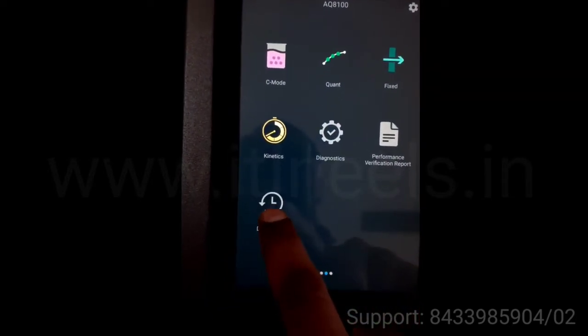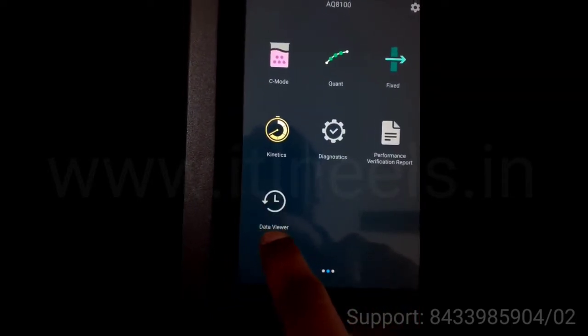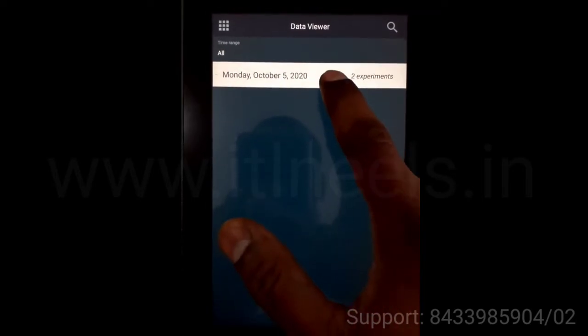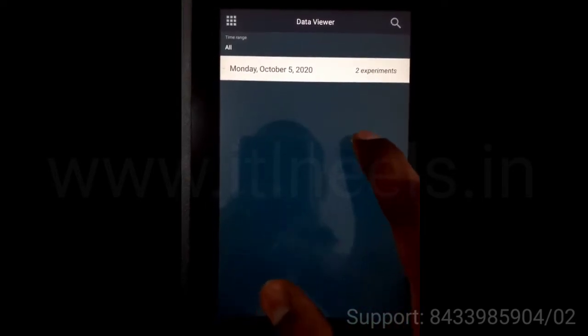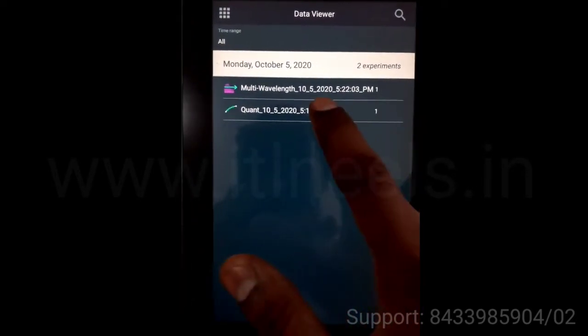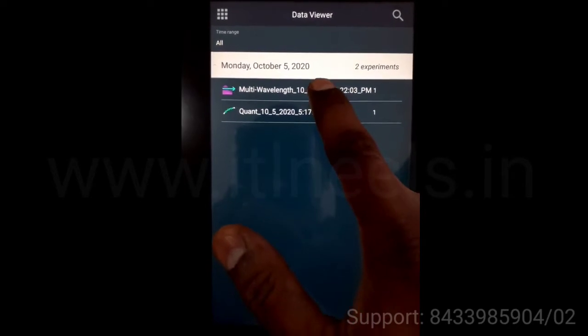This is the data viewer. You can save all the experiments, the results over here. You can take a printout as well.